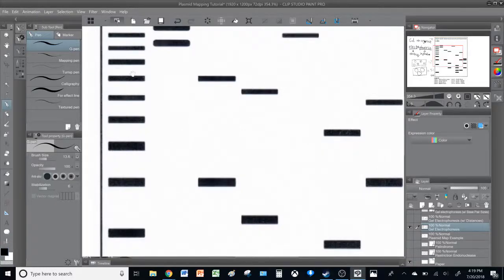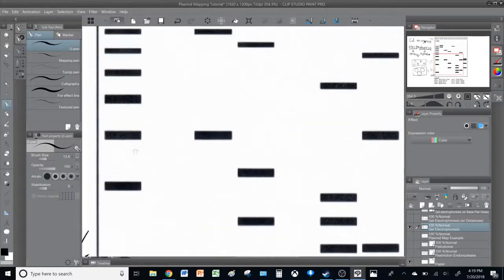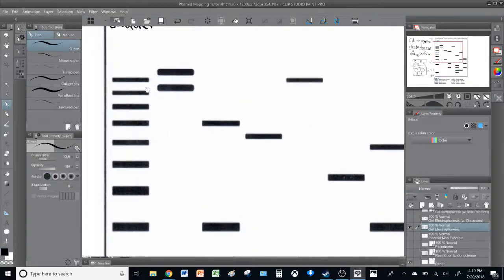It's called a ladder because it looks like a ladder. It's the fiducial point for comparing band sizes. The reason we use this is because each band size is known. So this is 5,000, for example, then 4,500 base pairs, 4,000, 3,500, and so on. We will label them in a bit. So these bands are basically the ruler for the bands in the unknown lanes.